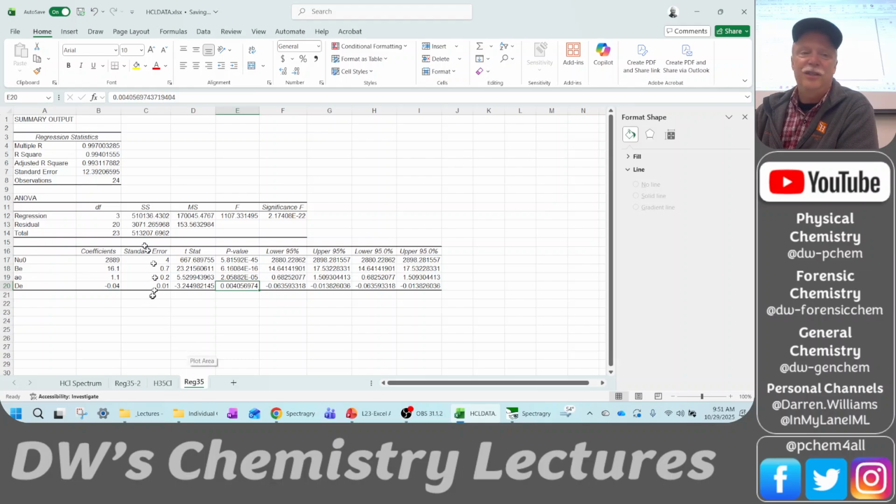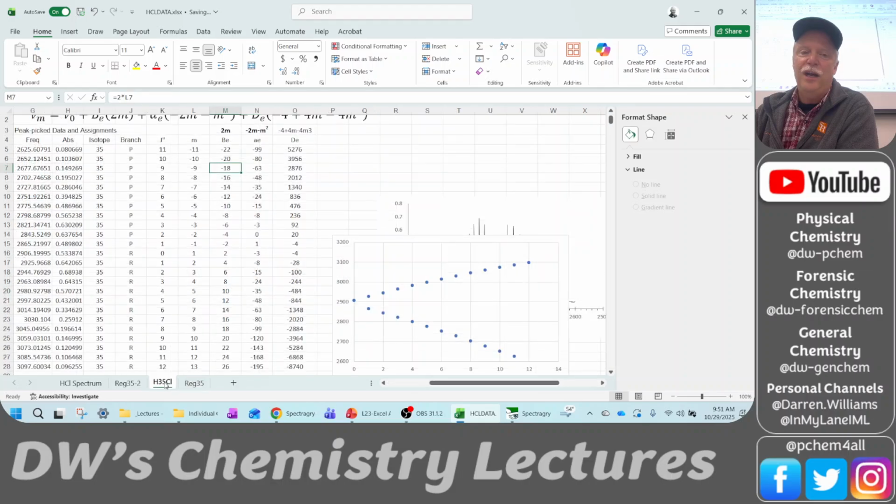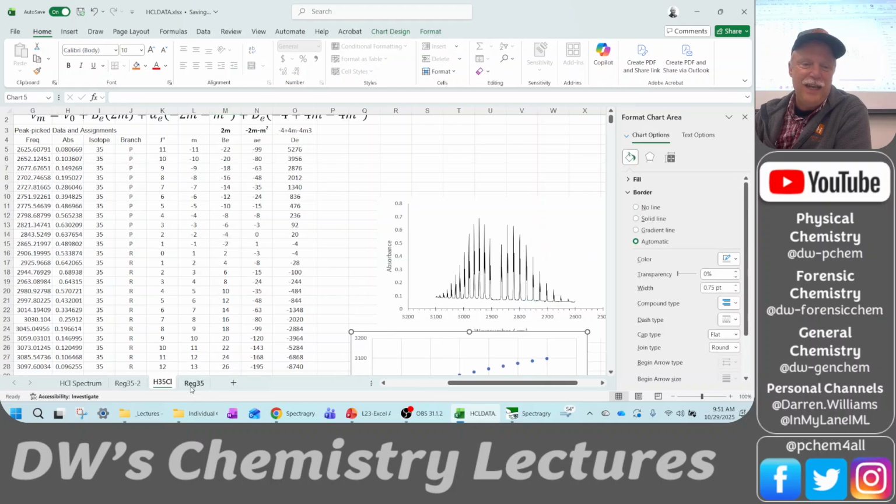Okay, and so as soon as I saw this bad regression, I knew, okay, there's something wrong with my table. And I'm so glad we were able to find it, because it would be a really terrible video to go through all of this and say, something's wrong, but I don't know what it is. Right? So we went in and we found that problem. Okay. So that's our regression.